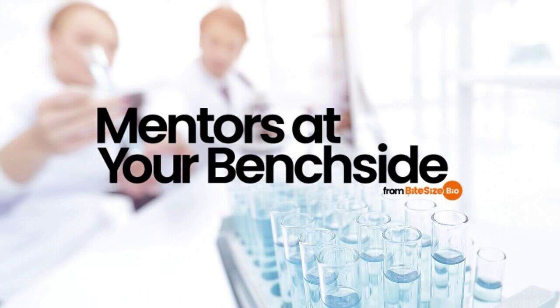There are two ways of using chloramphenicol for your plasmid amplification. Number one, use chloramphenicol according to the Maniatis. This is a recipe from the classical protocol cookbook by Maniatis et al., aka the Maniatis. Maniatis recommends growing your culture until saturation, then adding 170 micrograms per mL of chloramphenicol and continuing to grow the culture for a further 16 hours. You will stop protein synthesis completely in an already dense culture. The cells will stop growing, but the vector will keep amplifying.